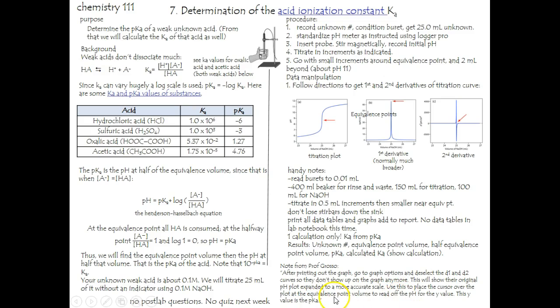Now make sure that makes sense. I'm a little worried that it sounds like you are at the equivalence point, not half the equivalence point. So be sure that you can make sense of that and everything works out well.